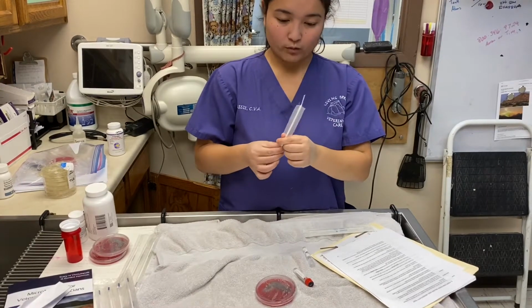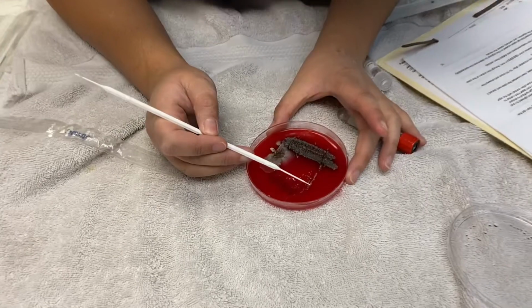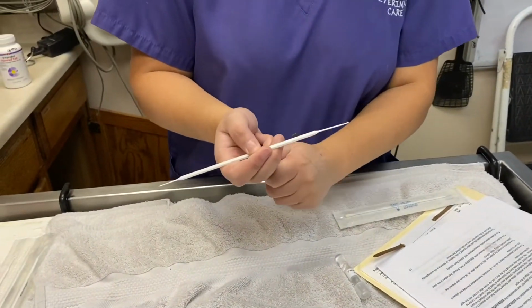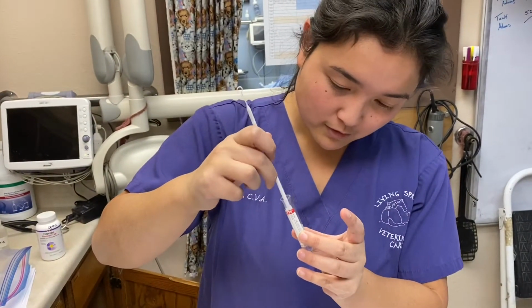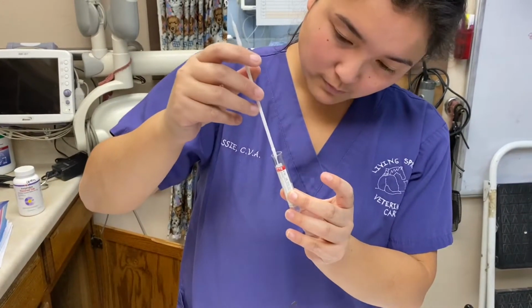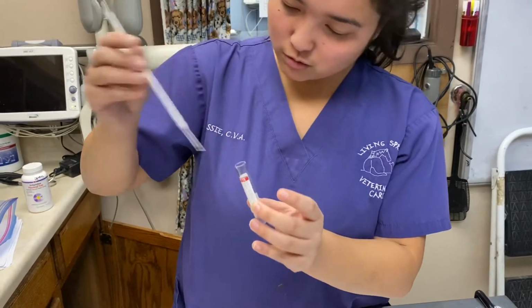I'm going to get my loop. Alright, I'm going to grab a couple of those colonies right here. Okay, stick the organisms in the tube and mix it. Okay, so it looks like I got most of the organisms in the tube.